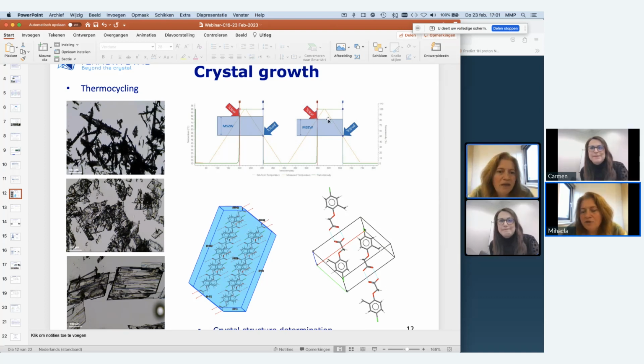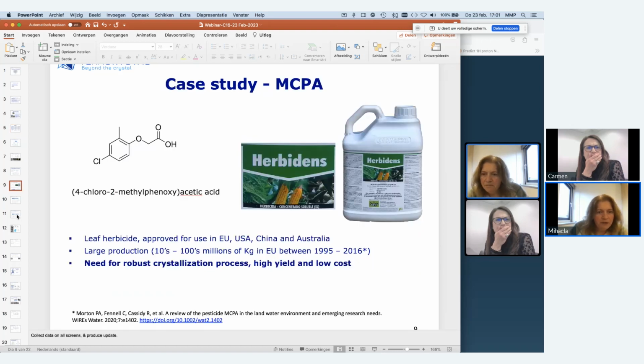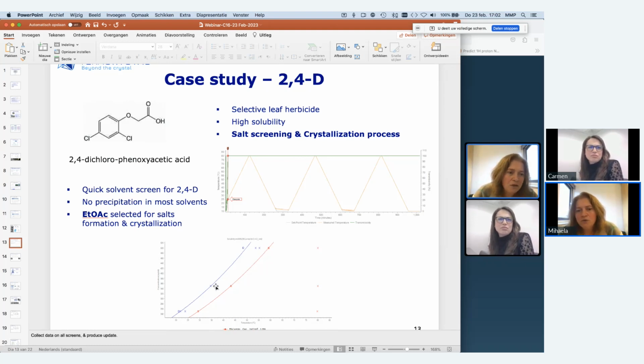Well, I have to say I just took it as an example. So it could be that it doesn't match exactly, but what we basically do, if I find a metastable zone, which is nicer, let me see, in the beginning maybe. Here. Indeed, I will have to check how many cycles, but of course you don't want to degrade your compound. So usually up to 5 cycles we used to do, for a certain concentration, depending on the metastable zone width. We would usually prefer a broad metastable zone width, but not at very high temperature, such that we can run more cycles.